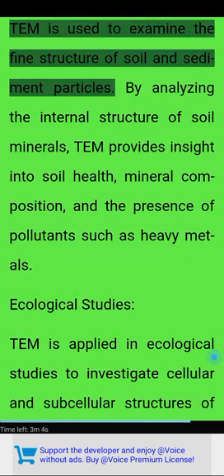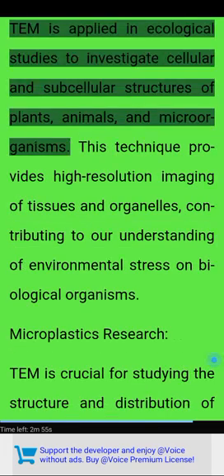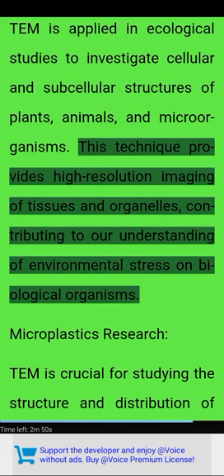Soil and sediment studies. TEM is used to examine the fine structure of soil and sediment particles. By analyzing the internal structure of soil minerals, TEM provides insight into soil health, mineral composition, and the presence of pollutants such as heavy metals. Ecological studies. TEM is applied in ecological studies to investigate cellular and subcellular structures of plants, animals, and microorganisms. This technique provides high-resolution imaging of tissues and organelles, contributing to our understanding of environmental stress on biological organisms.